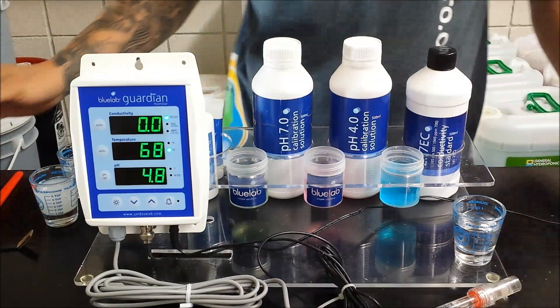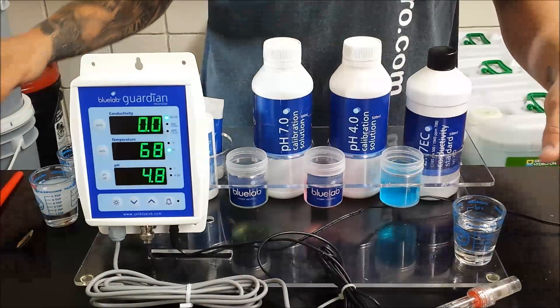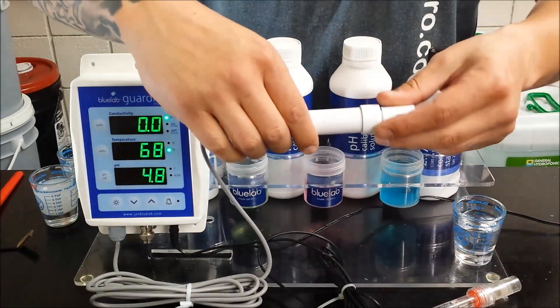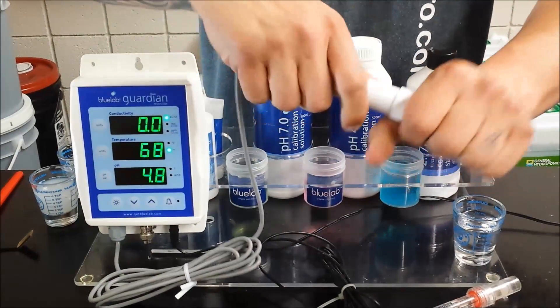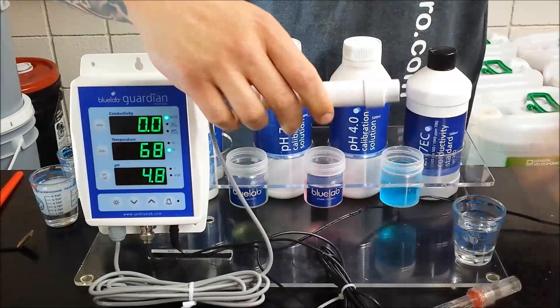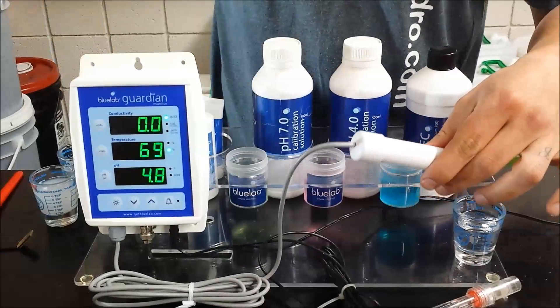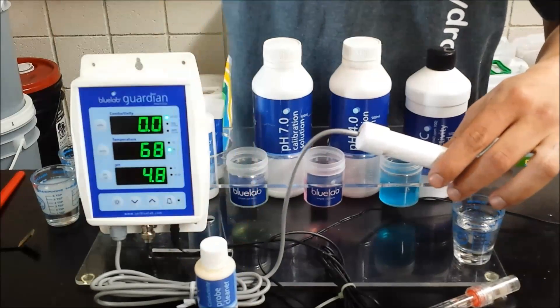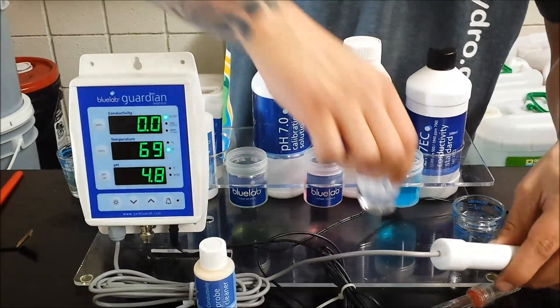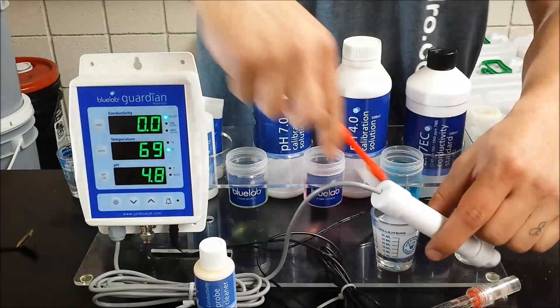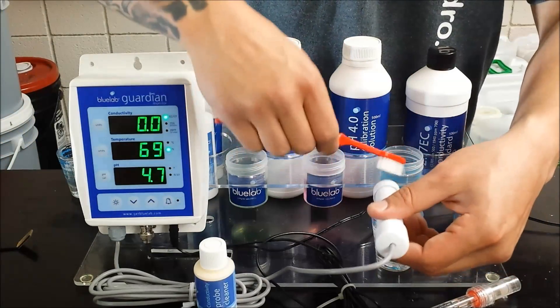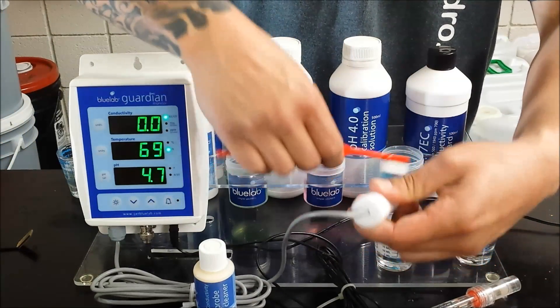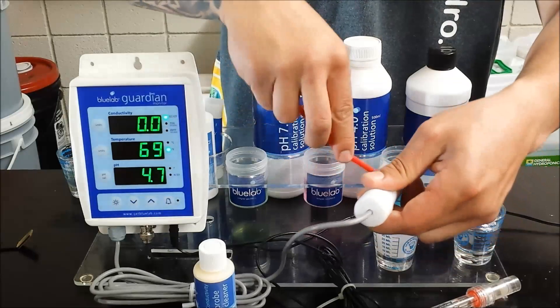First thing you want to do is make sure your probes are clean before calibration. Starting with the nutrient probe, you want to remove the protective guard. We have some Bluelab nutrient probe cleaner here mixed with some water to get our cleaning solution. You're going to want to scrub off any nutrient reservoir residue that can be on there.